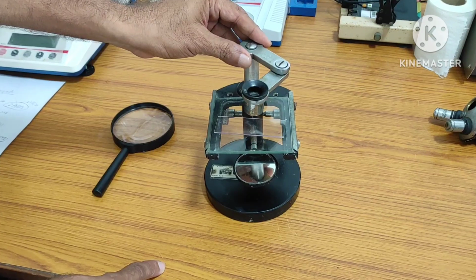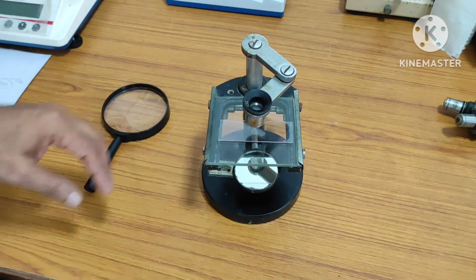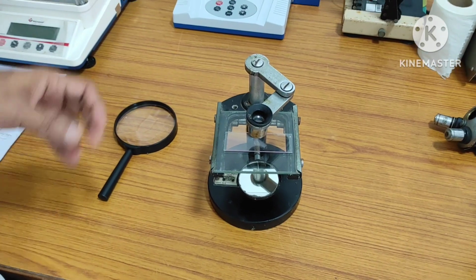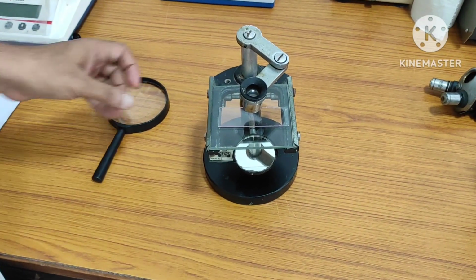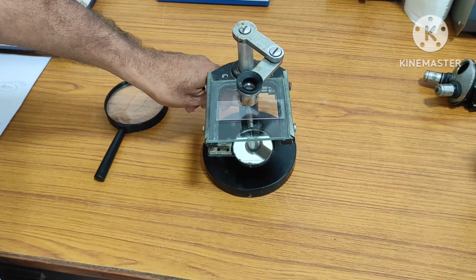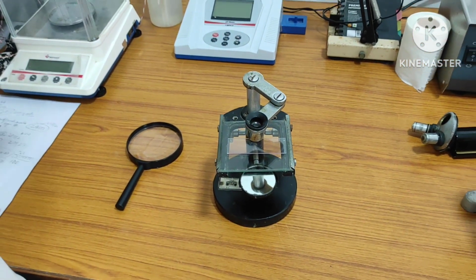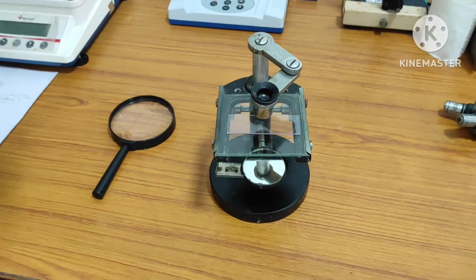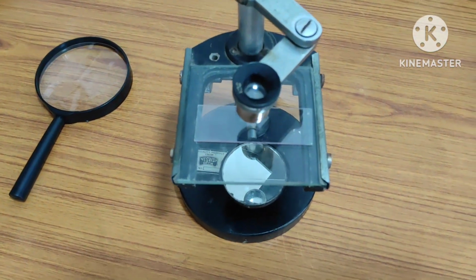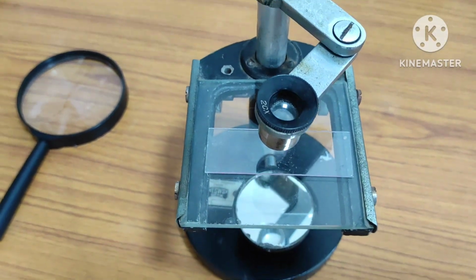So, the simple type of microscope, highly adjustable, right? These days these are present only as specimens in old laboratories and old institutes. Nobody is using them, but they were highly useful when we were doing experiments, especially to observe flower parts, stamens, even ovules, and even pollen grains.